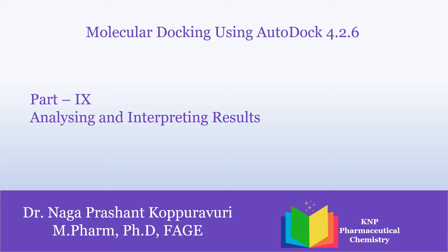Hi all, in part 9 of molecular docking using AutoDock 4.2.6, we are going to analyze and interpret the results for the docking runs which we have earlier performed for our drug and control.